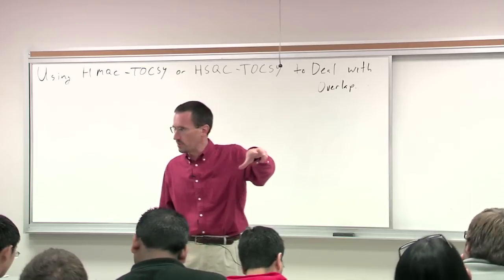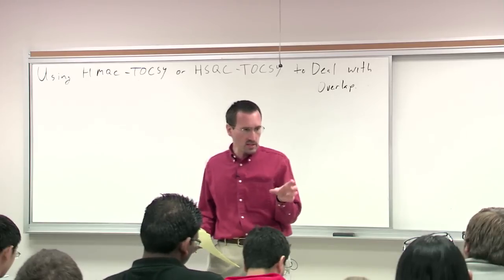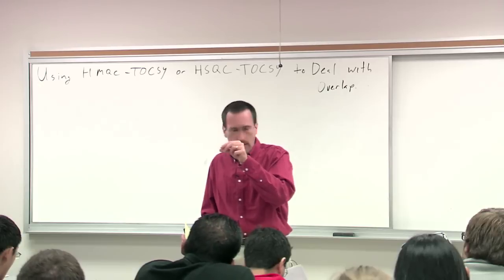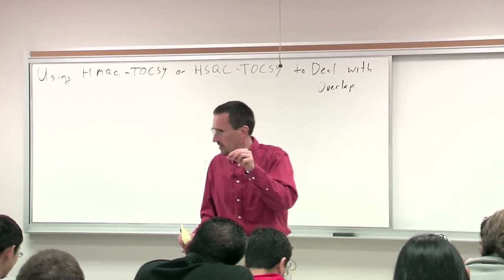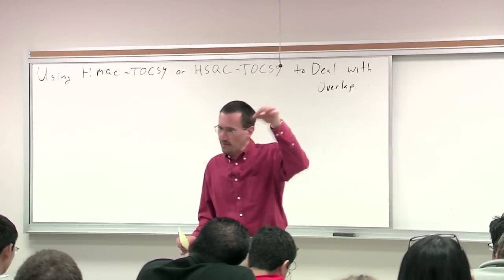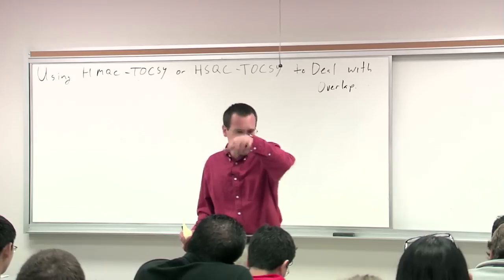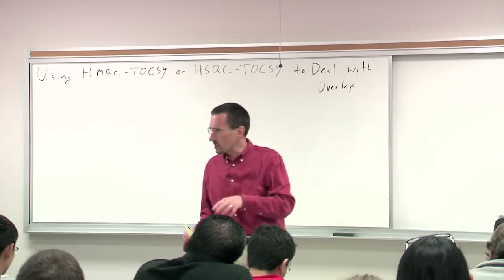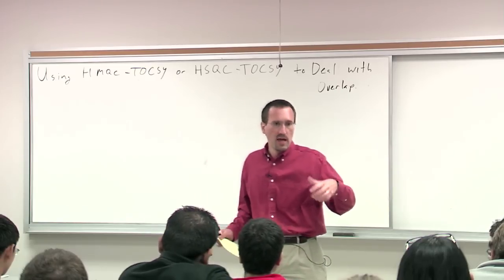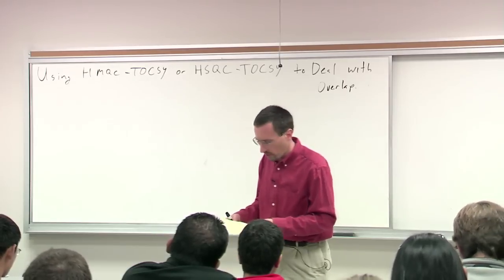Either you can get the whole spin system at once, or remember that spin lock mixing time parameter. If you begin with a really small spin lock mixing time, you can go one more jump beyond COSY. And if you have a longer parameter, you can go two jumps and three jumps. So you can use a series of TOCSY spectra like a super COSY spectrum. And as long as you have some regions that don't overlap, you're in good shape.